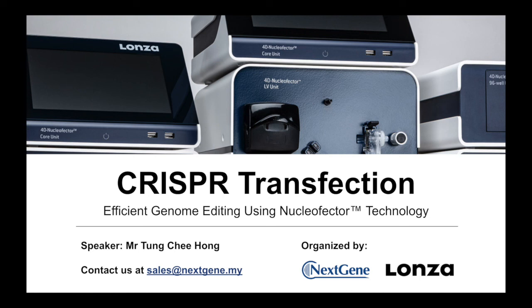So maybe I will do a search later, then I will share the link to the guide RNA designing tools available online. When designing, most of the parameters will be set by the designing tools, so no worry. The only thing I would like to add is that you may want to consider choosing more than one design sequence, because, as shared earlier, the region that we target might have different effects. Some actually work better than others.